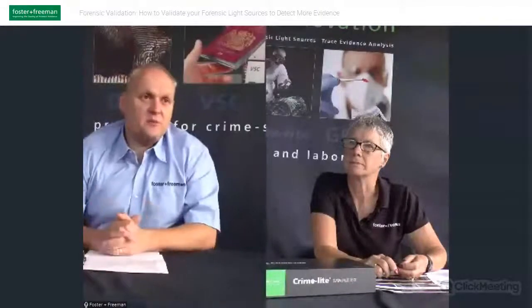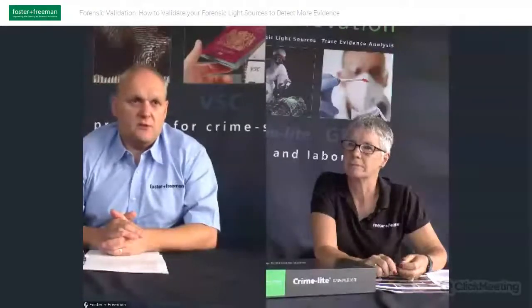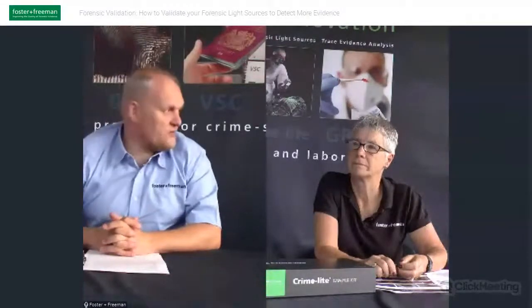That's where the name comes from. So when you select, for example, the blue light or the blue-green or the green light in the Crime-lite Auto, the Auto will automatically select the filter, so you don't have to think about it. Now, the Auto is also quite clever in that although it will select the best filter, that doesn't stop you from putting it into manual mode and overriding the filters, because in some instances, quite rare instances, but you can actually get better results by going to a higher filter in some instances.